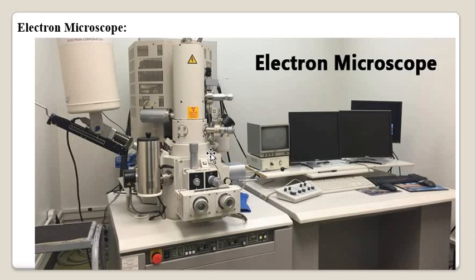The working of the electron microscope is very much similar to that of the light microscope. The electrons are used for magnification and image formation. Image formation occurs by electron scattering, and electrons strike the atomic nuclei and get dispersed. These dispersed electrons form the image, and the electron image is converted into visible form by projecting it on the fluorescent screen.